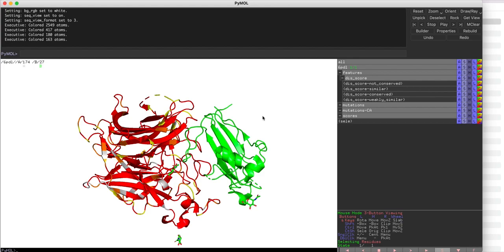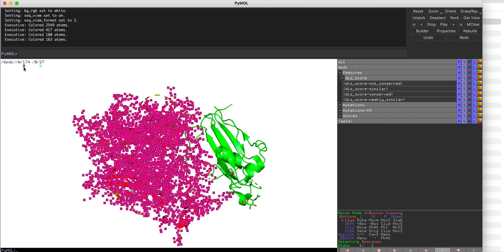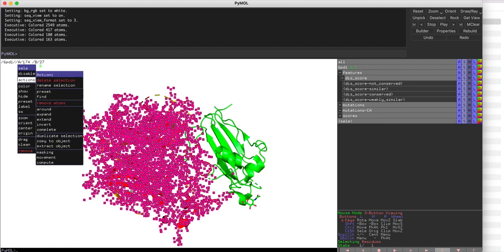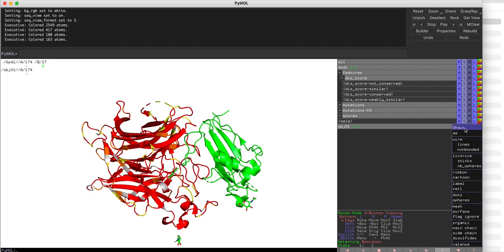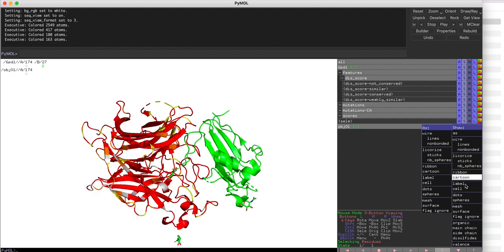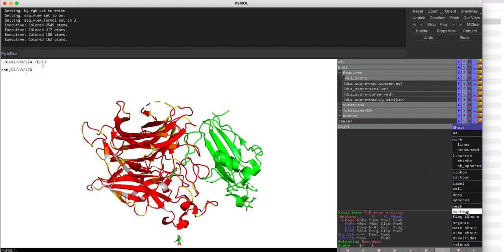I would like to view the glycoprotein as a surface. For that, I will create a copy of the object and then view this new copied object as surface.